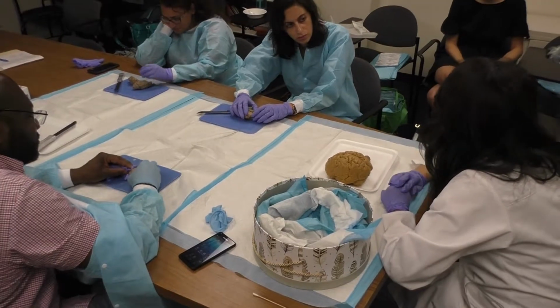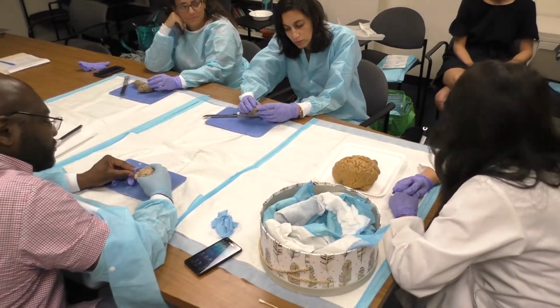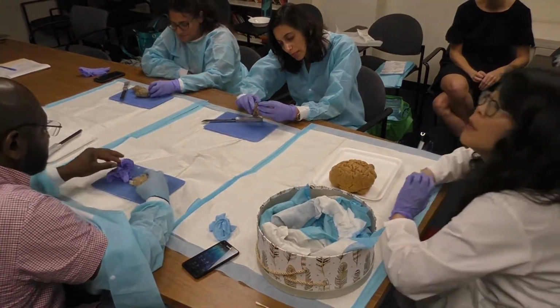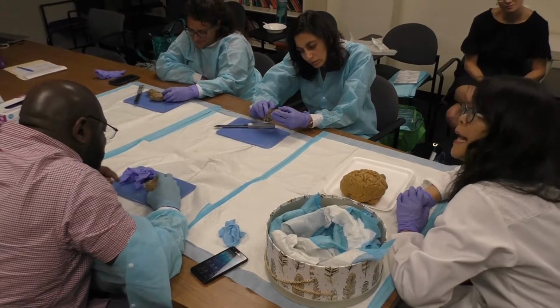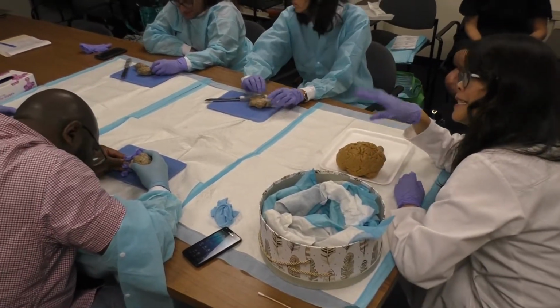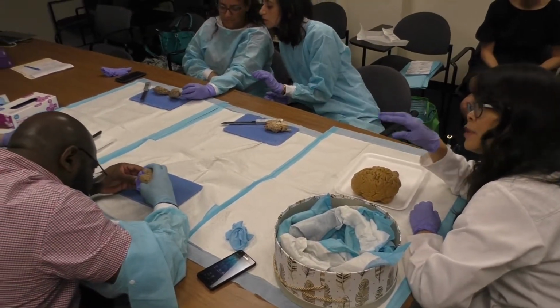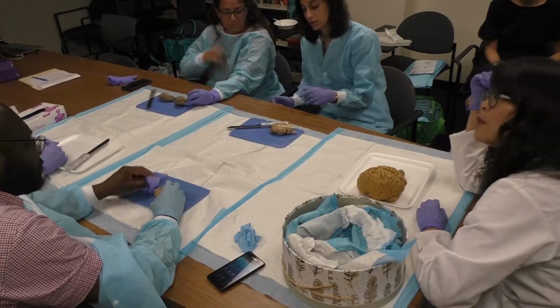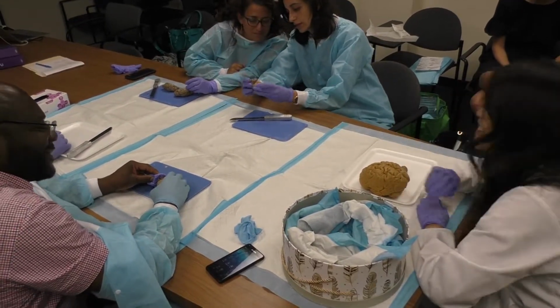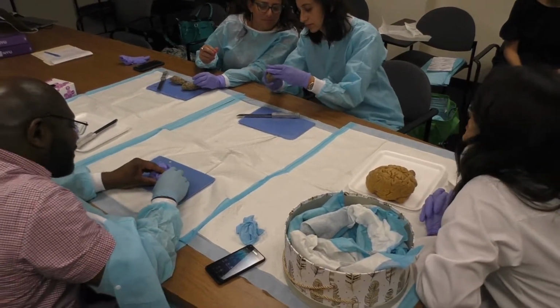And remember I told you how good the sheep is at vision? Which one is bigger, superior or inferior colliculus here? Superior. Superior is huge, it's humongous, because the sheep has a very highly developed visual system. Sheep can identify and discriminate all of the other sheep in their flock from each other and from sheep not in their flock. And that's hard because all sheep look identical. Sorry, that was just a joke.